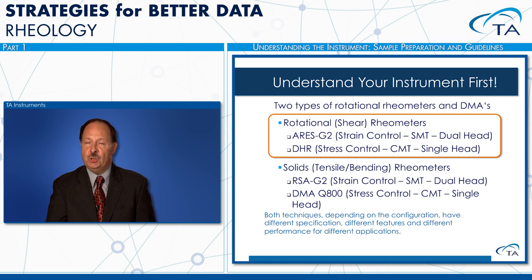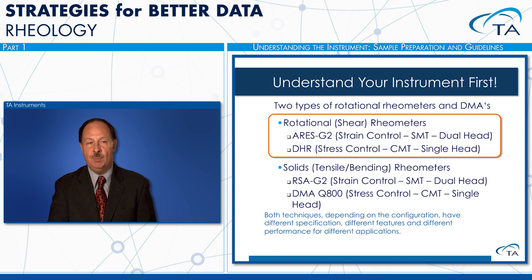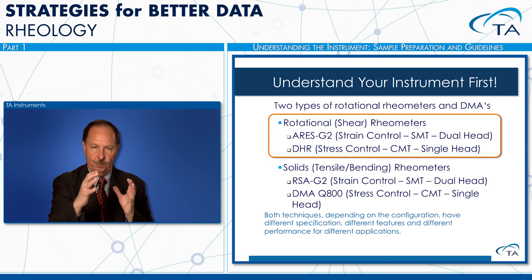We have the Aries G2, and sometimes in our presentations, we will use the term native mode. For the Aries G2, the native mode of deformation is strain control. You'll also hear us use the terms SMT, that's separate motor and transducer, or dual head. We have illustrations that will show what we mean by these terms. We also have the DHR rheometers. Their native mode is stress control, or torque control.